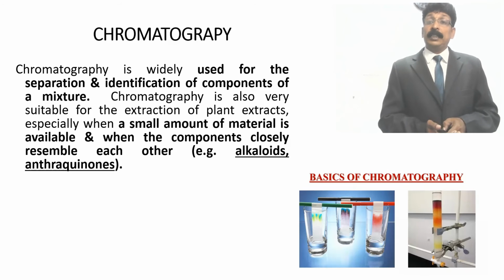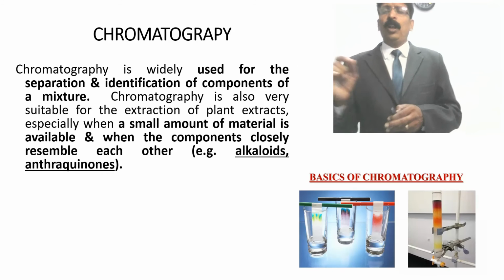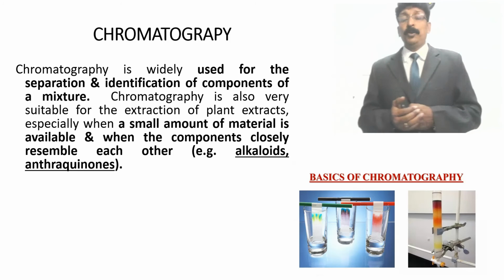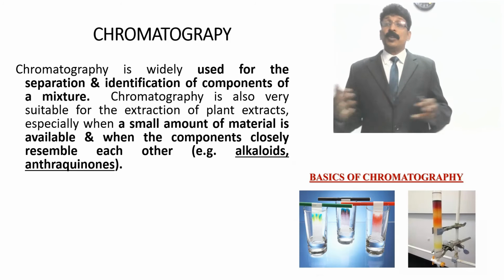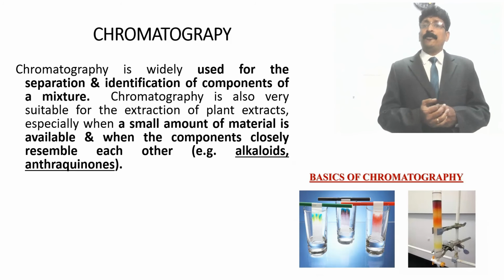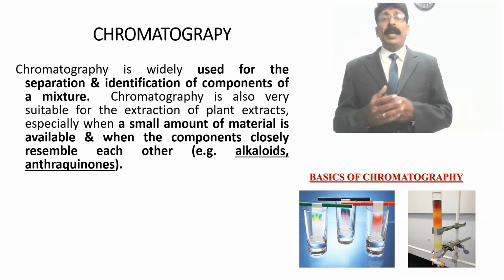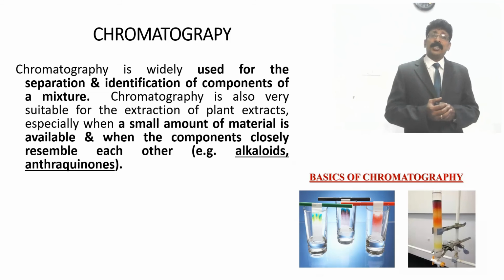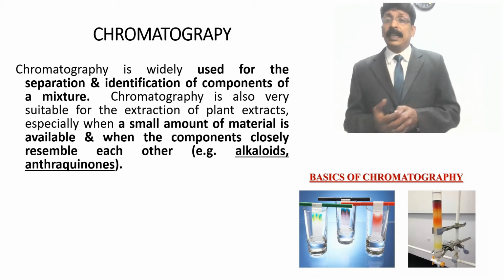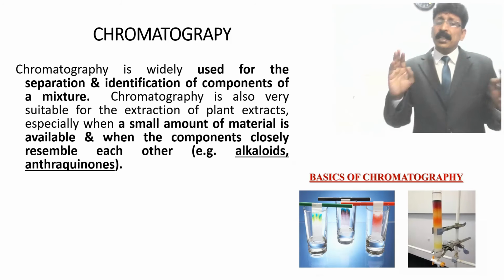And here we are going to see what chromatography is. Already we know it, as you might have studied it in other subjects also. I am giving a small explanation, and it may be helpful for you in other subjects, where you can incorporate whatever knowledge you have. Chromatography is a technique widely used for the separation and identification of compounds of a mixture. Otherwise, if anyone asks what chromatography means, it is a technique used to separate a mixture of compounds.